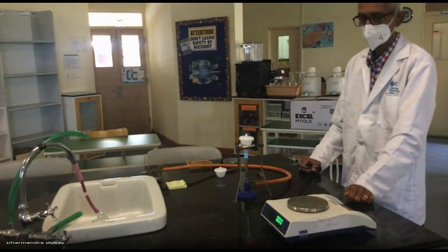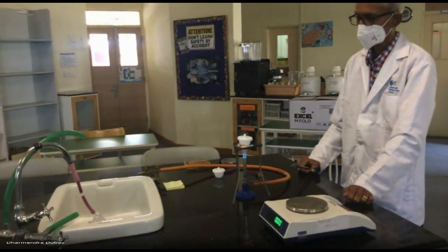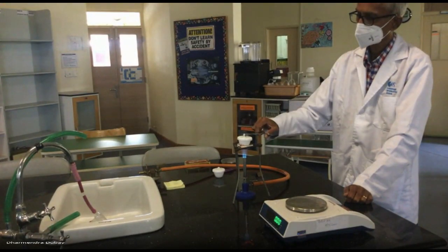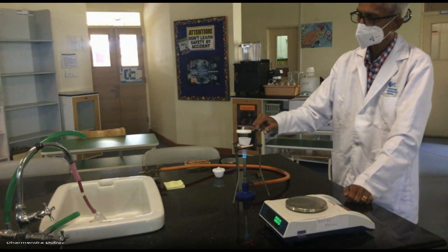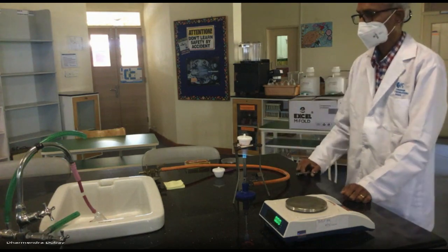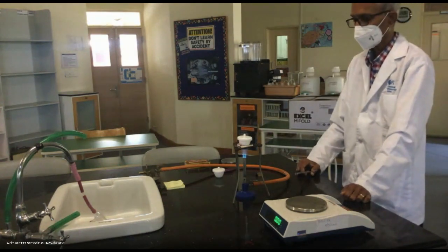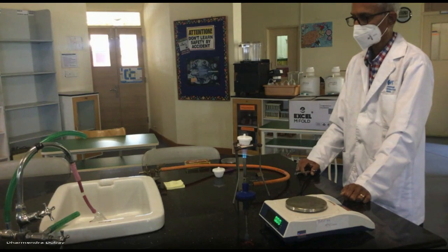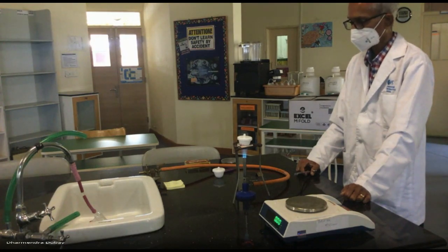What do you think? If we use a big piece of magnesium, like a really long ribbon, 15-20 centimeters, would that increase the accuracy of our final answer? Let's say you touch that piece with the tongs. There's only a certain amount that could rub off on the tongs. And if you had to open the lid five times, there's only a certain amount that would be lost. That percentage loss would be smaller the bigger the mass. You see that?